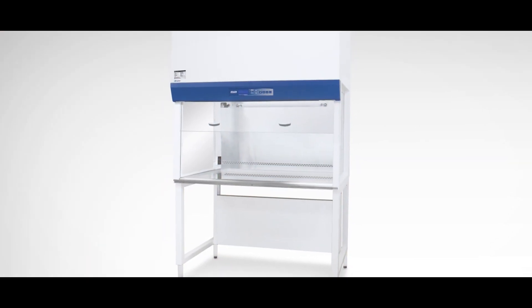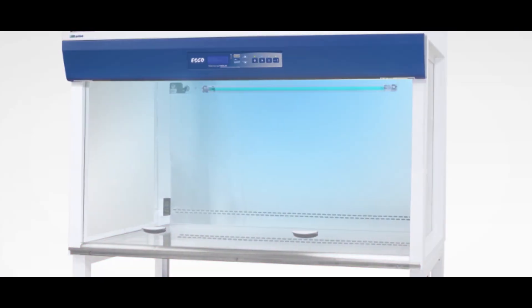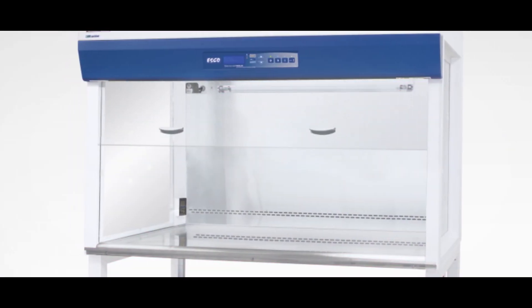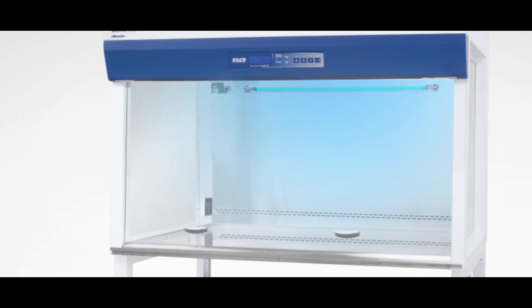With these new models, it gives the convenience of using a manual sliding sash window without needing to order a separate front cover for UV protection. Simply slide the sash window to activate the UV light.